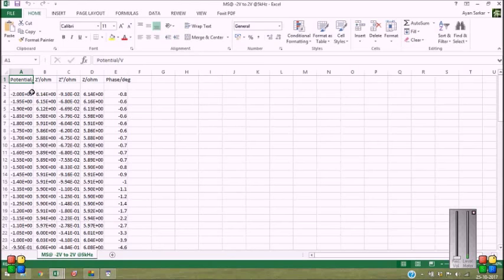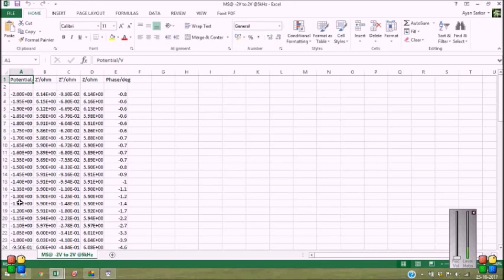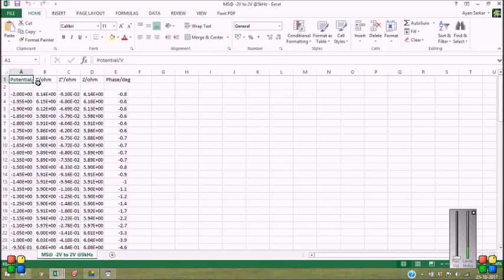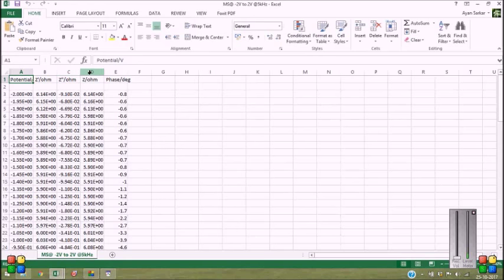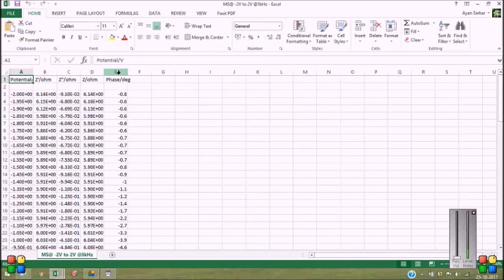Now, you can see column A represents the potential values. Column B represents the Z' values, which is actually the real part of the impedance. And column C represents the Z", the imaginary part of the impedance. And D is the Z impedance in Ohm and column E represents phase.